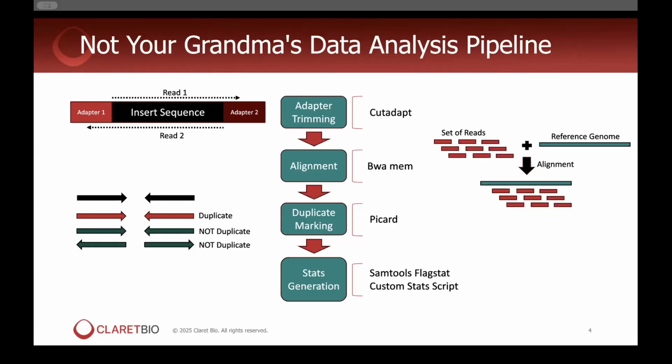And so we use Picard duplicate marking because you have the ability to not remove the duplicates from the BAM file, because we don't necessarily want to get rid of them, but we do want to be able to exclude them from downstream analyses, since we only want to be looking, excuse me, at unique reads.